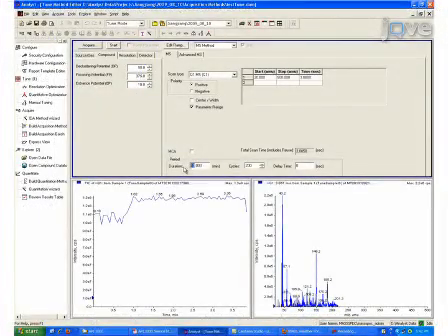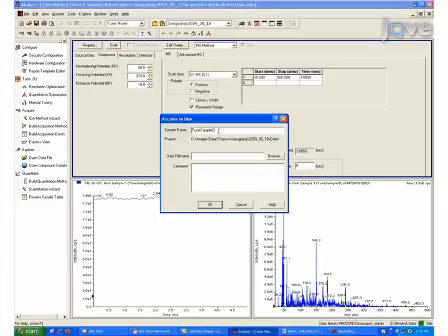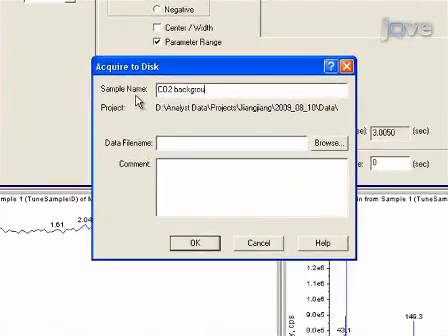Continue to collect spectra and a TIC for 5 minutes to ensure the instrument is stabilized. With instrument stability ensured, enter the acquisition parameters as appropriate for your experiment. Record a carrier gas background spectrum for future experiments.